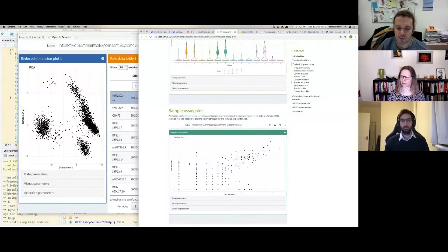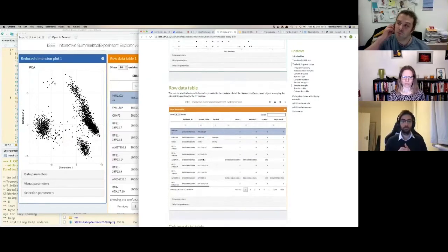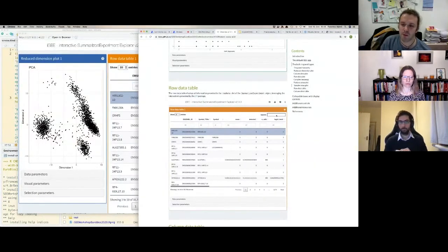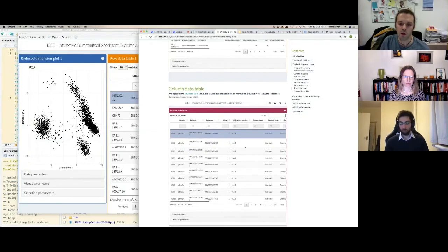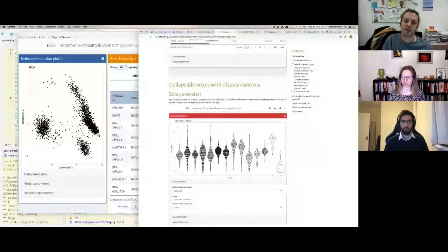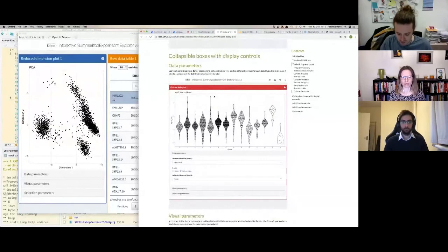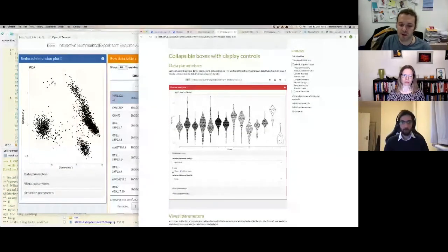Tables are extremely useful for linking panels and for interactively browsing row-level or column-level information. Below every panel you have three main control groups: Data Parameters, Visual Parameters, and Selection Parameters. Data Parameters control what you display — what goes on each axis, which reduced dimension, etc. — and depend on the panel type.